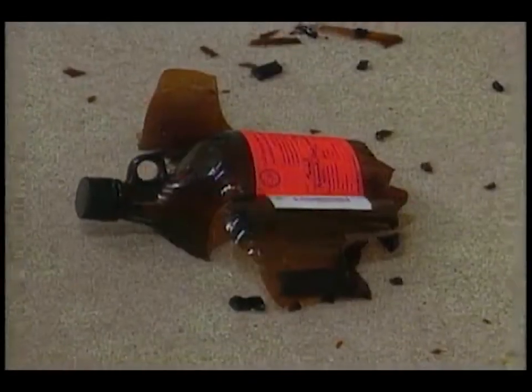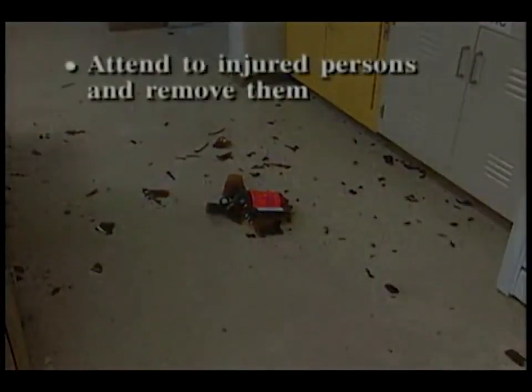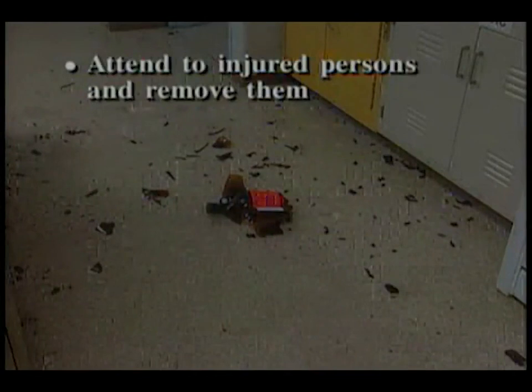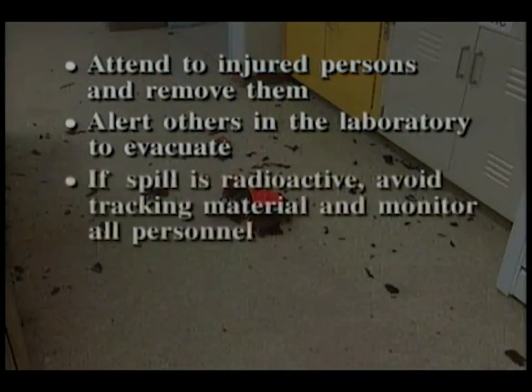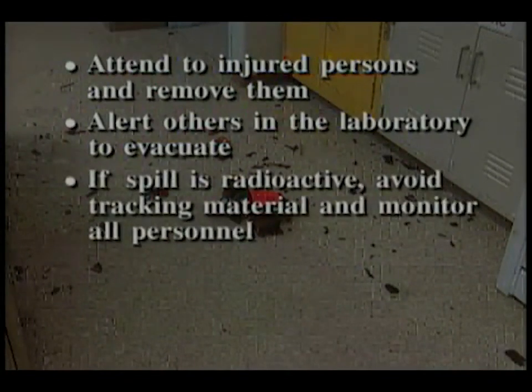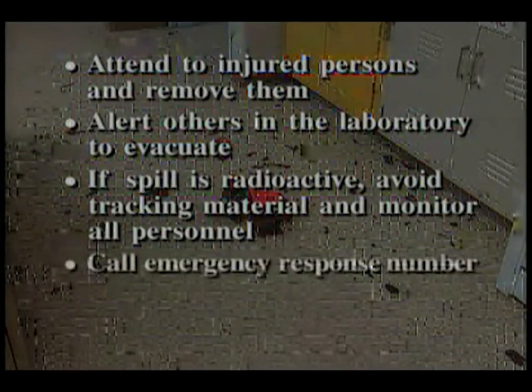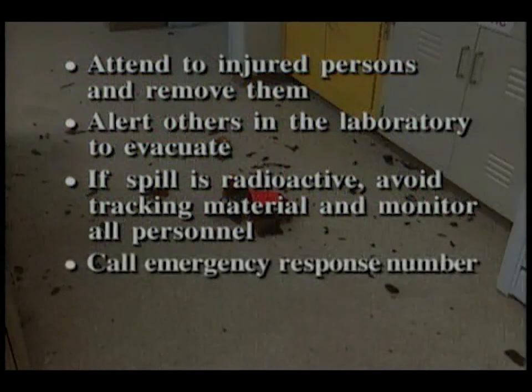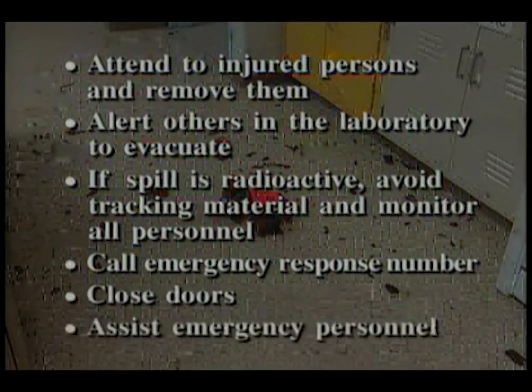Cleanup of any major spill should be left to safety and emergency personnel. But laboratory personnel must take some immediate action. Attend to injured persons and remove them. Alert others in the laboratory to evacuate. If the spill is radioactive, avoid tracking material and monitor all personnel. Call the emergency response number. Close doors. Assist emergency personnel.